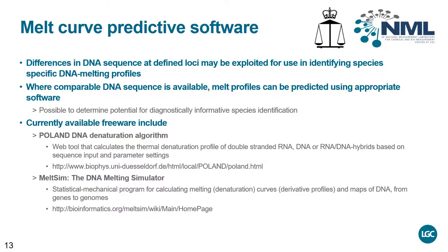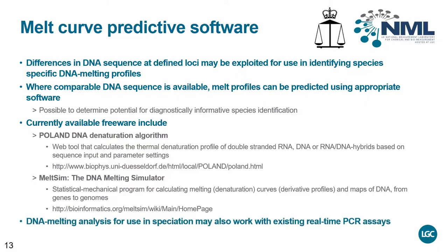Alternatively, the open access application MeltSim can be employed, which performs a similar analysis to that of the Poland package. The web addresses for the Poland and MeltSim freeware packages at the time of recording are displayed on the slide.